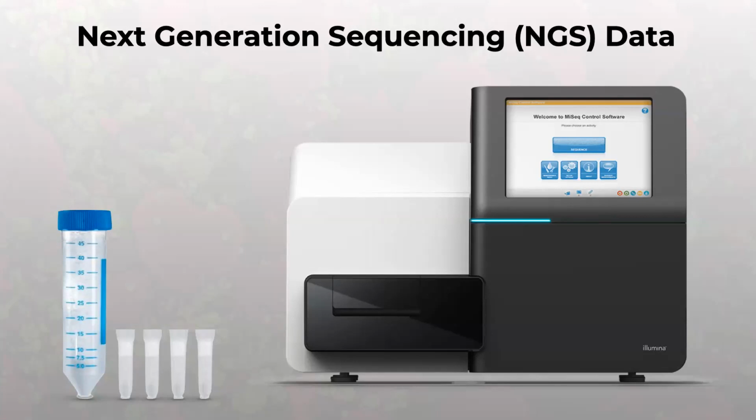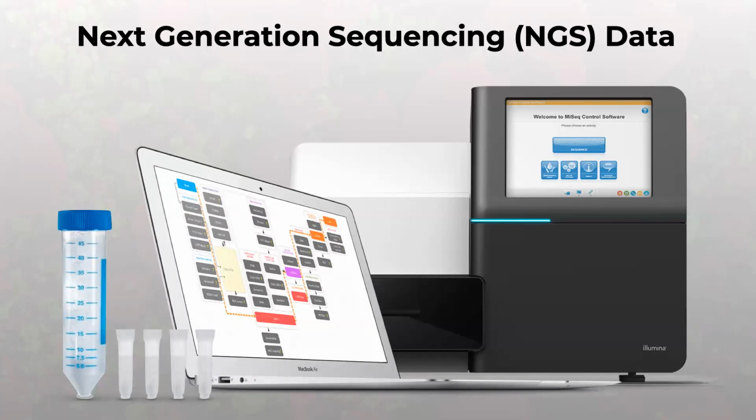Now, the way next-generation sequencing is used is also changing. It has been highly expensive and prohibitive in cases, but today the size of the instruments, the ease of use of those instruments, as well as the cost associated with producing high quality data have led to an explosion in next generation sequencing data. One of the challenges with next generation sequencing data is that it is still large and requires specifically designed tools to be able to extract meaningful patterns and find associations between short sequences and phenotypes. And so let's talk a little bit about what are some of these associations and what kind of metagenomic data are available to study infectious diseases.